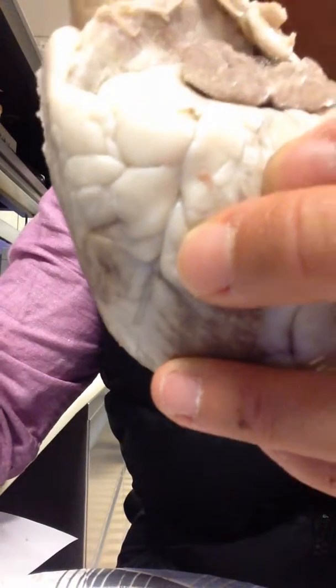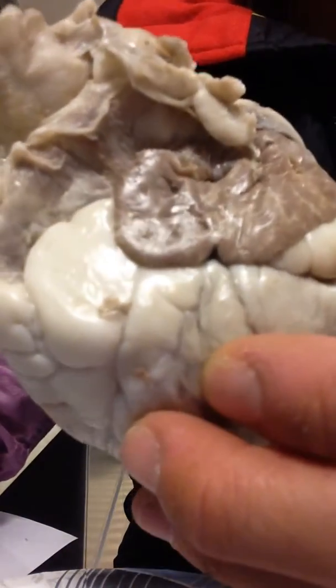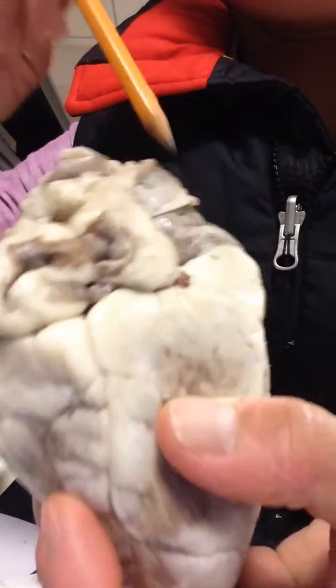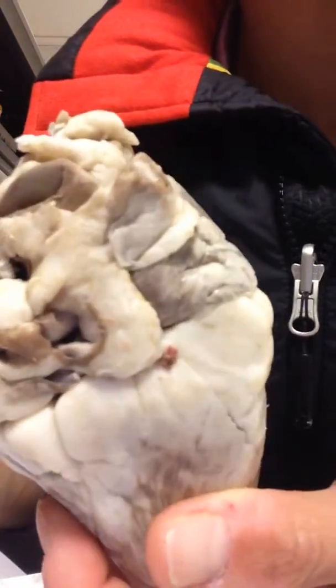Okay, so that's that. And then superior vena cava. Let's see where that is. Again, we're looking at the back side. I think it's here. Let me see. It's this one that goes up. That is missing. So that's a superior vena cava.